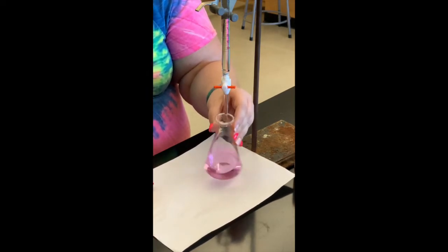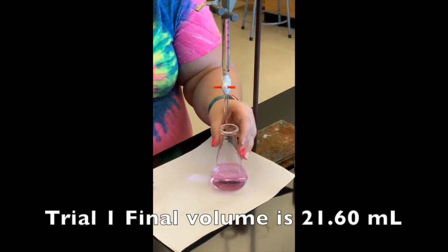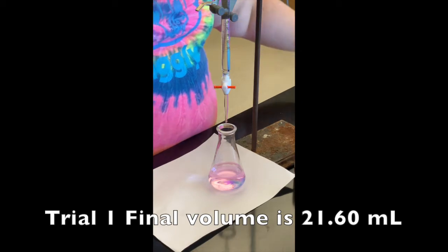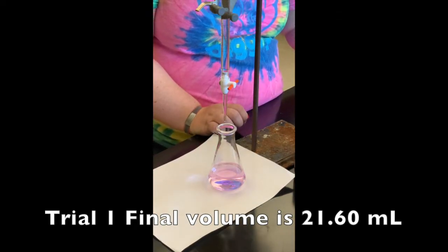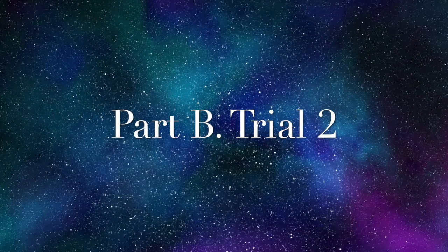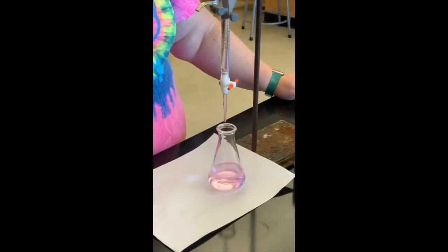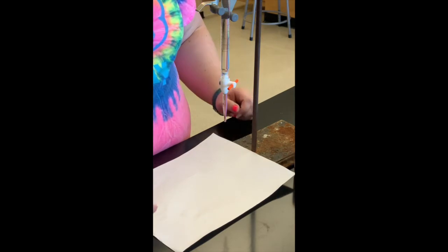I think we've reached the endpoint — the pink does not appear to be going away. I'm going to record my final volume for trial one. I'll put that piece of paper behind the burette so I can see it better. The final volume is 21.60 milliliters. Remember that when you use a burette you should be recording to the hundredths place. I still have at least 25 milliliters left in the burette, so I'm going to titrate trial two without refilling.